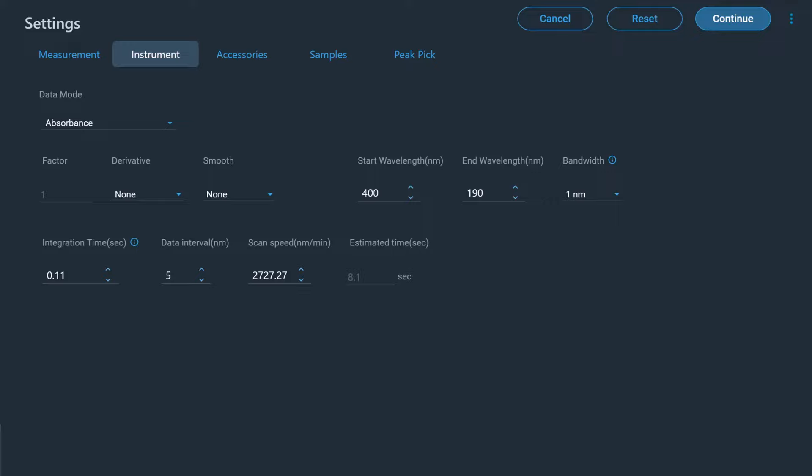If required, a derivative of the collected data can be calculated and a smoothing function may be used as well.